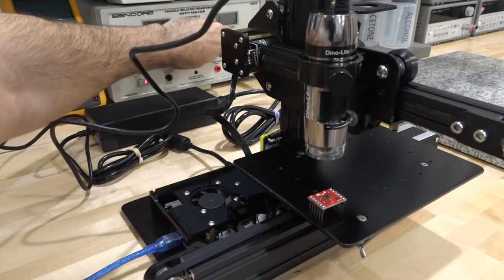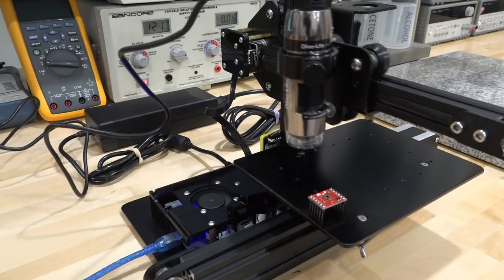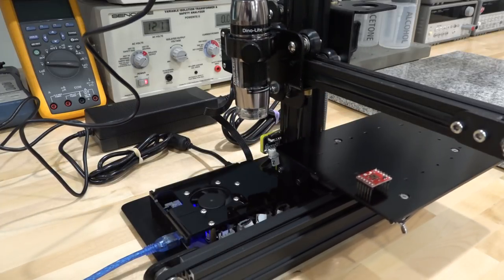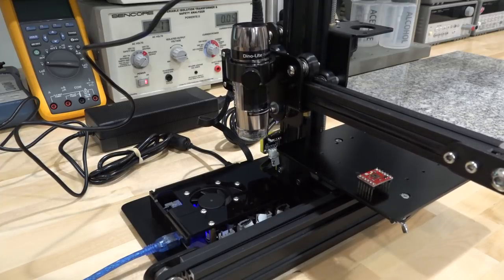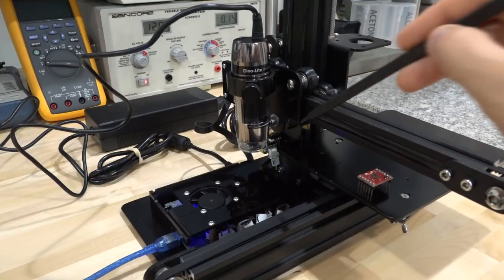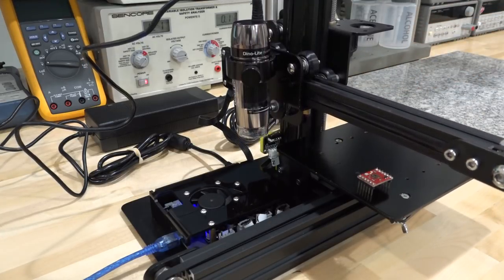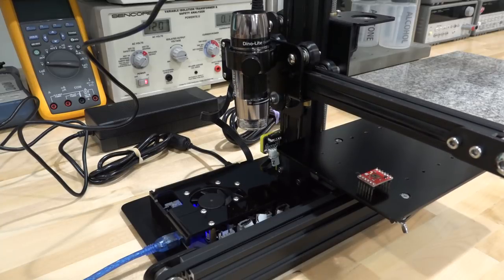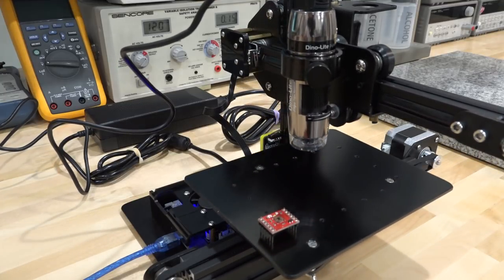I'm turning it on and it gets recognized by the computer as a COM port. Once it connects, it's going to bring it to a zero position. As you can see, it does some measurements so it knows exactly where the beginning or origin is. It's designed such that you will not crash the microscope into the platform during initialization — quite foolproof in that sense. Once it stops, I can put it to the park position, which is a position I defined earlier. It's quite nice and now it's waiting for us to do whatever we want.